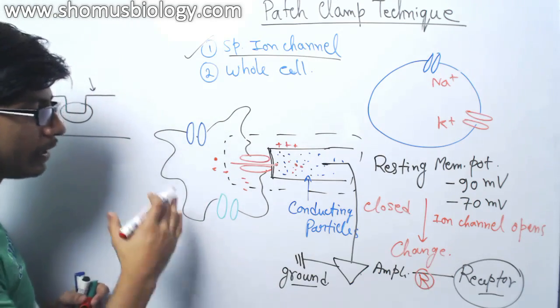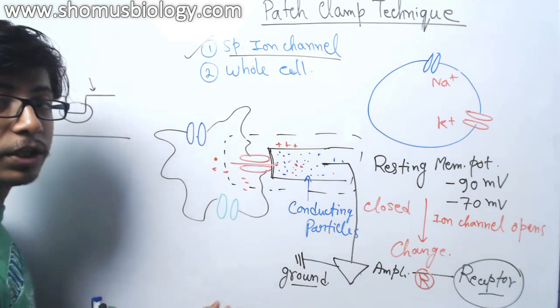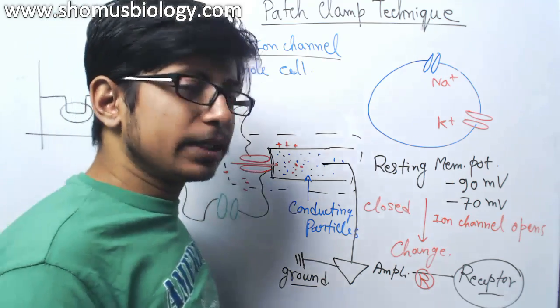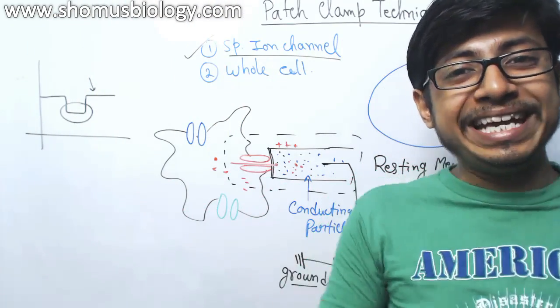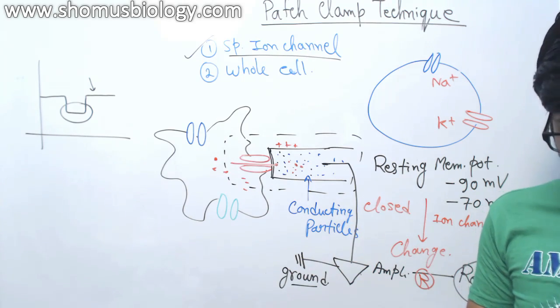What we can see, for a specific time duration, is the opening or closing of a target membrane ion channel, to say whether molecules are going out or going in with that time, and how the voltage is going to be altered for that.